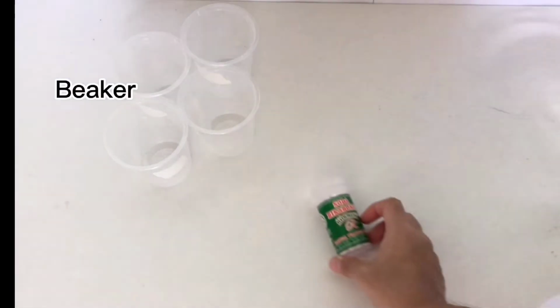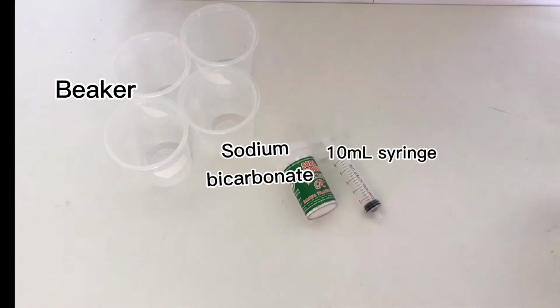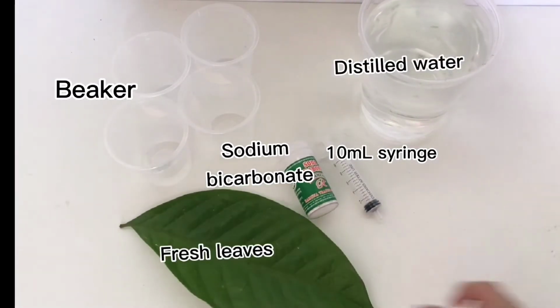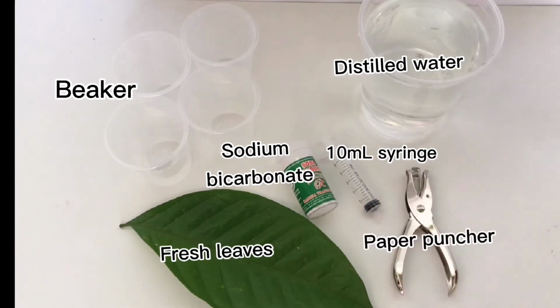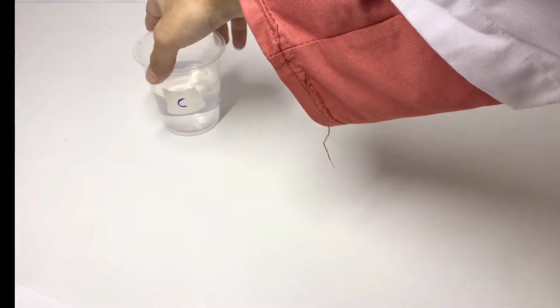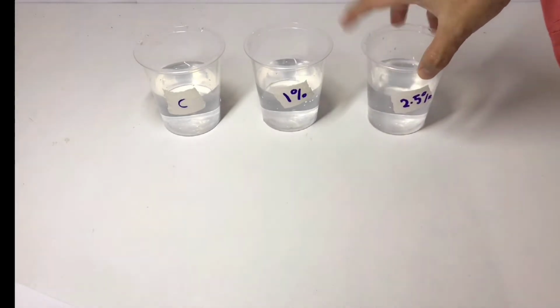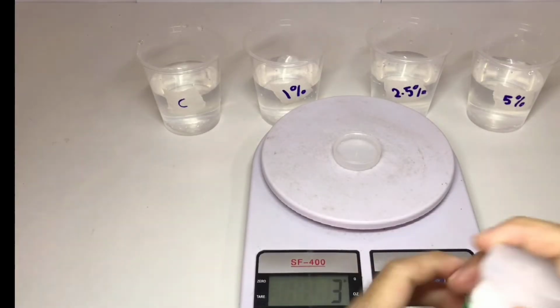The materials needed for this experiment are beaker, sodium bicarbonate, 10 ml syringe, distilled water, fresh leaves, and also a paper puncher. First of all, prepare a control sample that contains only water and also 3 different concentrations of sodium bicarbonate solution, which are at 1%, 2.5%, and 5% weight over volume.